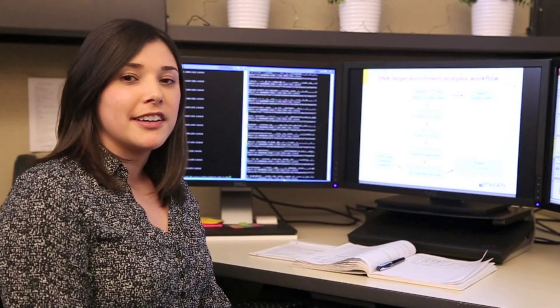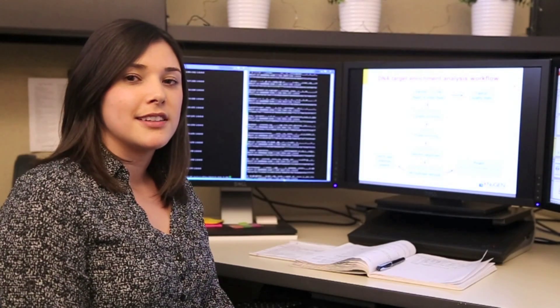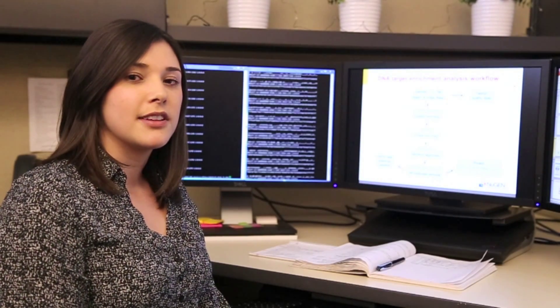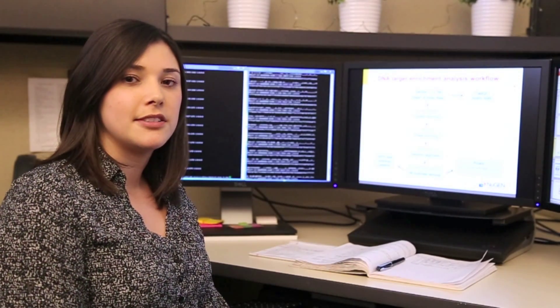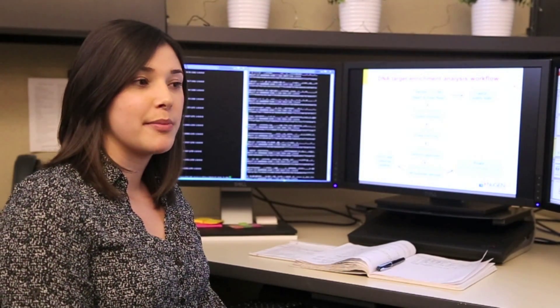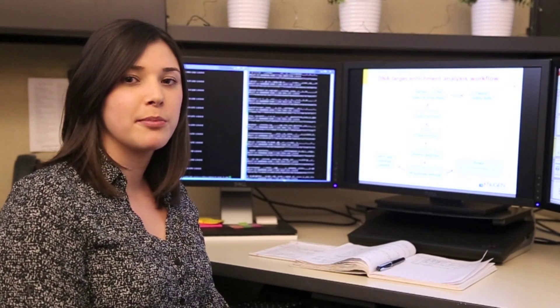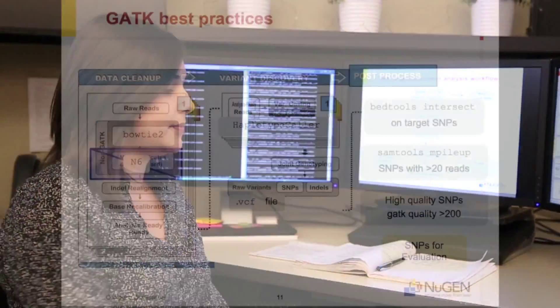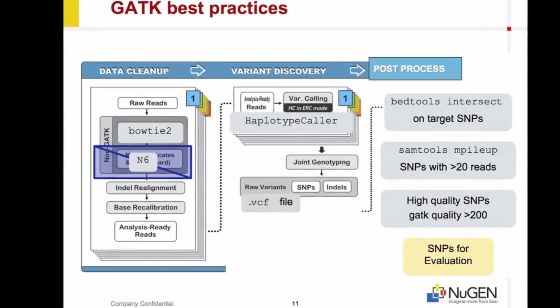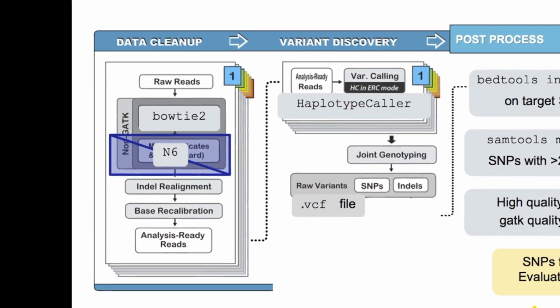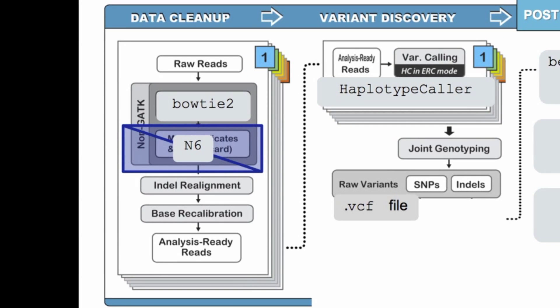The BAM file generated from the N6 duplicate marking tool can also be fed into the GATK best practices pipeline to get variant calls. After our Bowtie2 alignment, we use our N6 duplicate marking tool, so we skip the mark duplicates step in the best practices procedure.